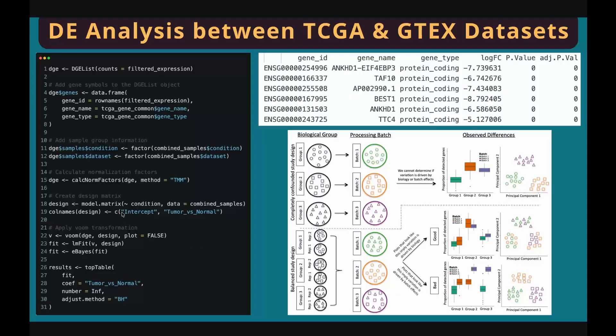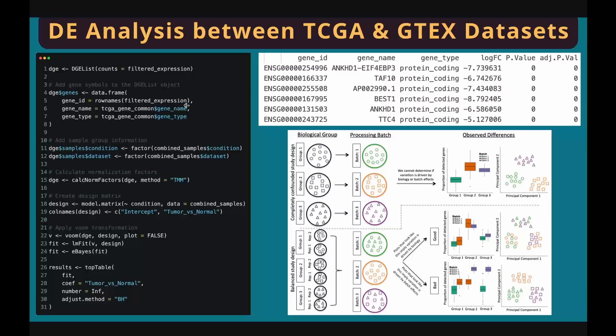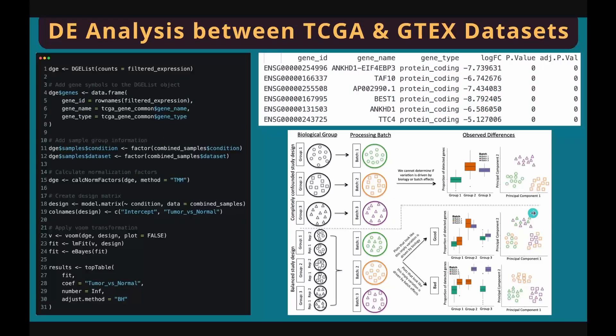With the combined gene expression matrix and the sample information table, we are ready to perform differential gene expression analysis. The process is the same as the one I demonstrated in my previous tutorial. You can use limma, DESeq2, or edgeR for DE analysis. Here I use limma. I'll leave a link of my previous DE analysis tutorial in the comments section.